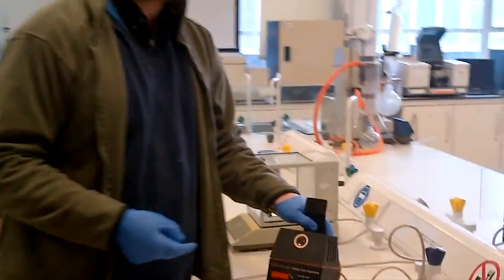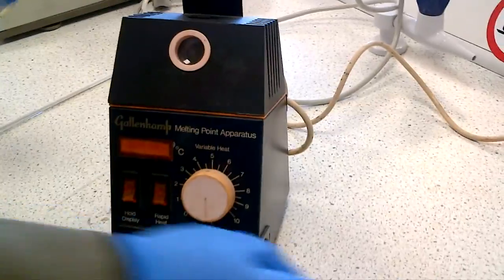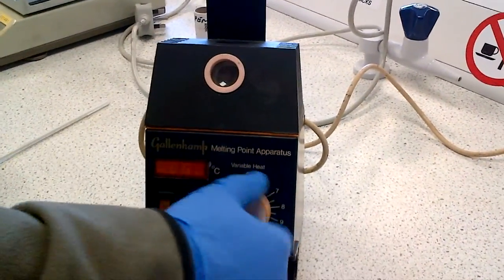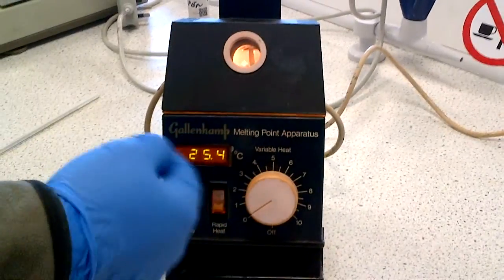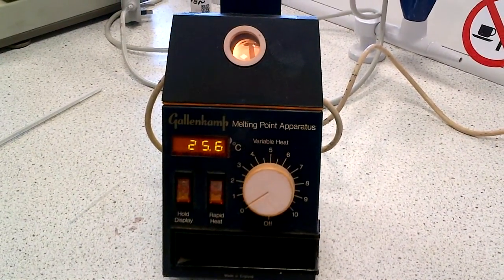So in this video demonstration, I just want to show you how to use one of these melting point apparatus. The first thing to do is switch it on at the mains, and you will notice that if you switch on with the dial, it immediately illuminates some current, it's sent through the electrodes.